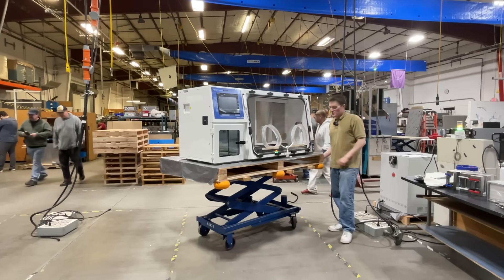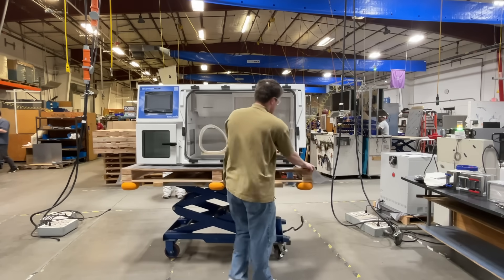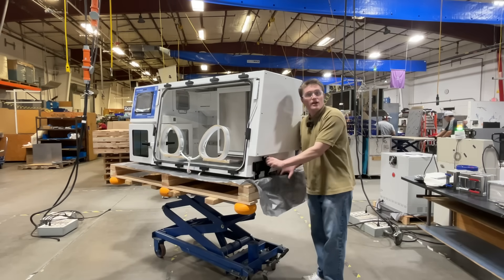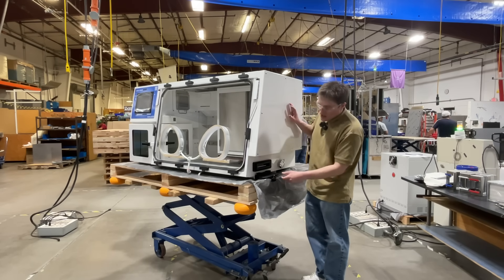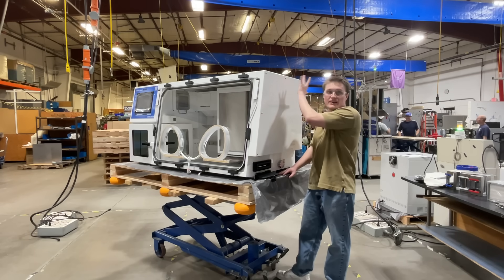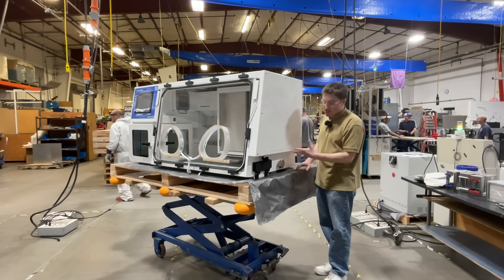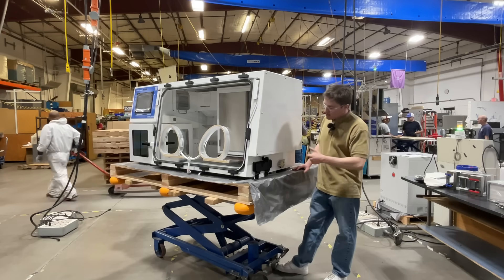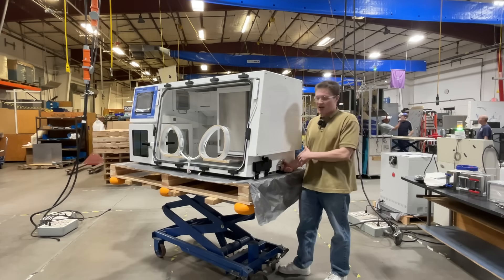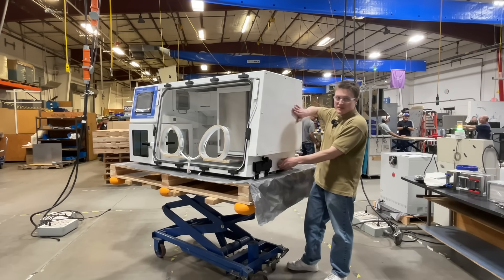Now let's take a look at the right side of the unit. Spinning around, the first thing you will notice is the single petri dish entry from before — that is this black door here. It has been designed specifically for this product to allow ease of introducing one petri dish at a time while maintaining atmospheric integrity within the unit. Over here, you will find the standard KF40 flange. This is used as an expansion port, so should you want to have any cable pass-throughs running from outside to inside the unit, this will allow you to do that while keeping the atmosphere.